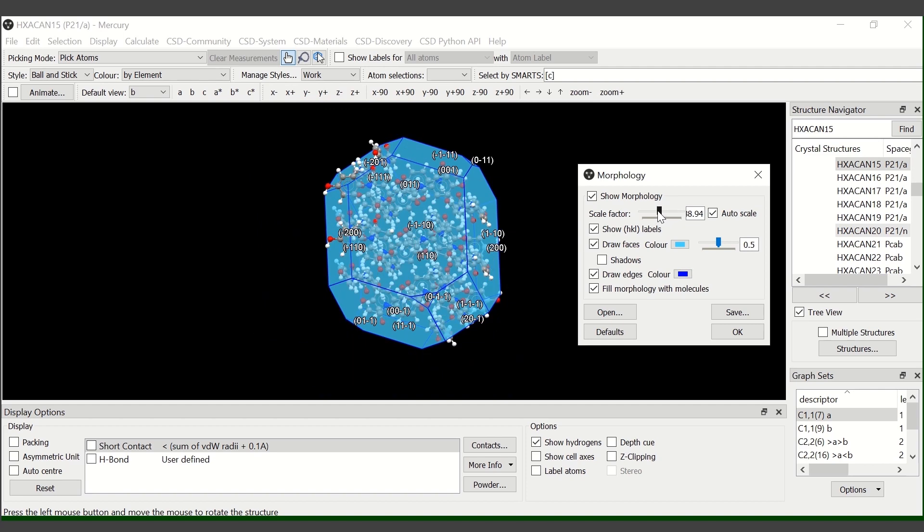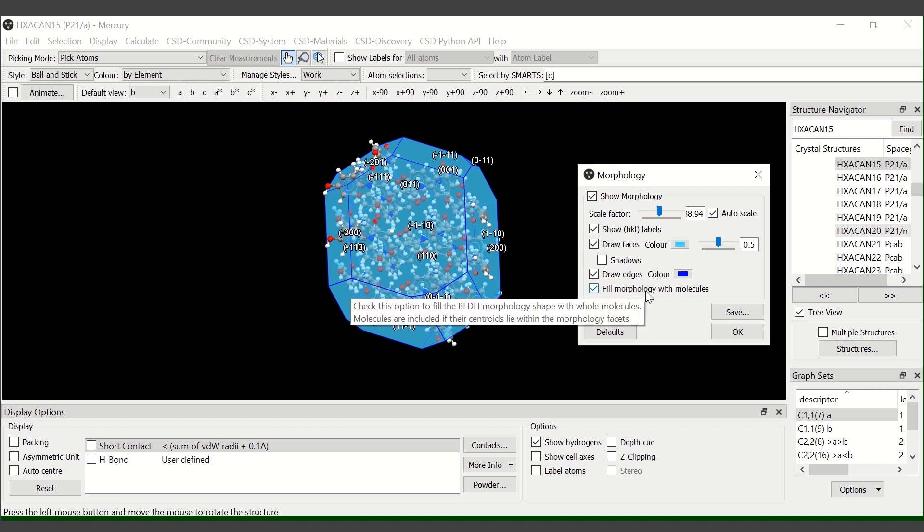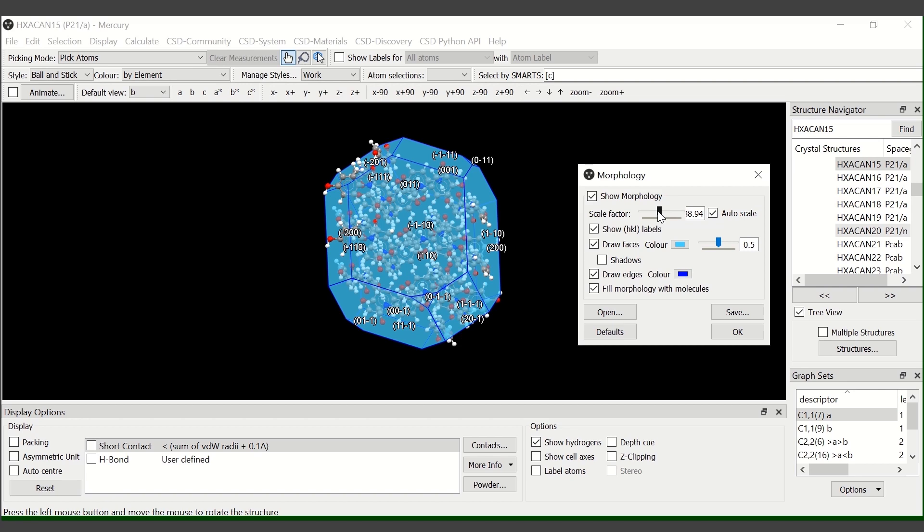We can see that if we have the fill morphology with molecules option on, it will automatically populate the crystal.